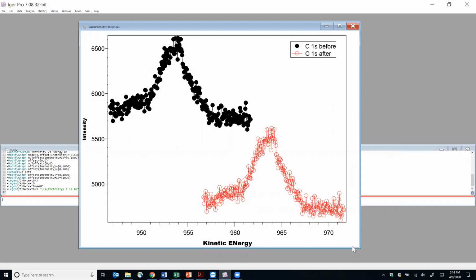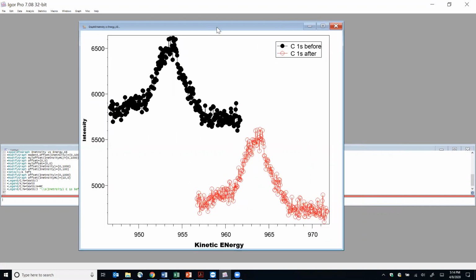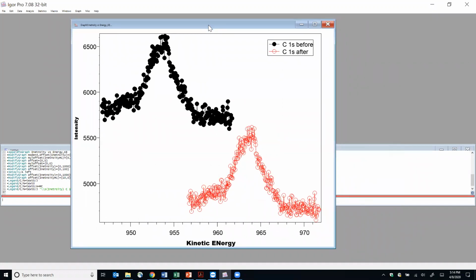Yeah. Okay. What I need from you, and it's what we actually do even for the data that you did, even something like that. This is how we publish.